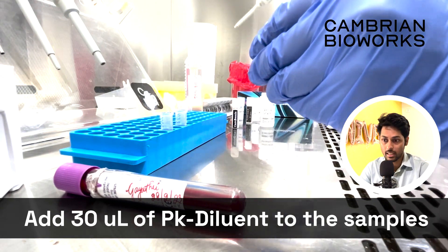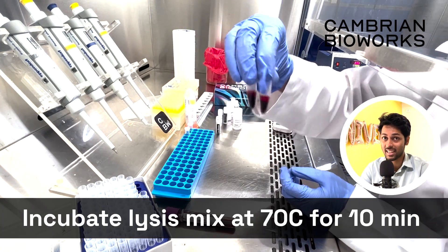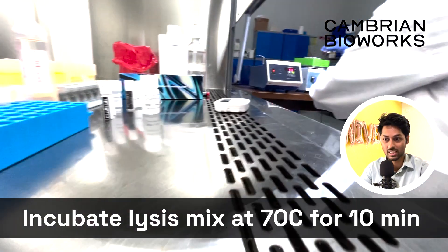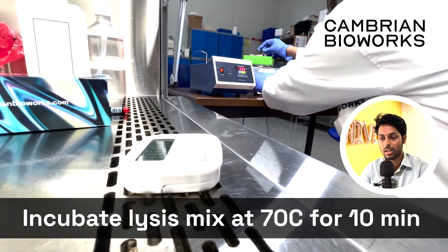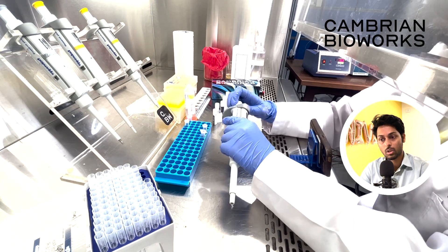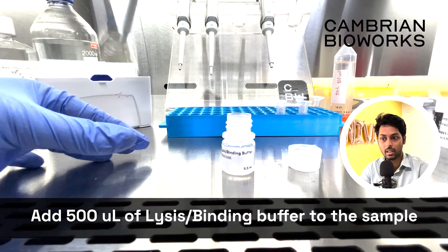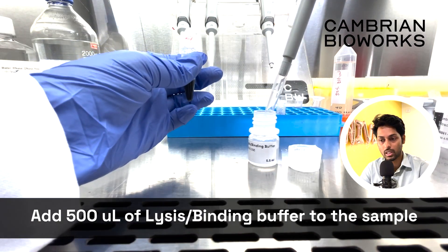Now incubate the lysis mix at 70°C for 10 minutes. Make sure that 70°C is exactly 70°C and not somewhere between 50 or 60. Try to be very specific about these two parameters — temperature and time — because we've observed that this is one of the very important steps to ensure maximum yield and good purity in the outcome.